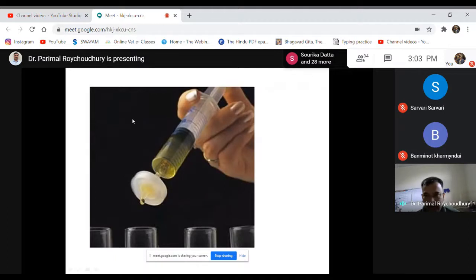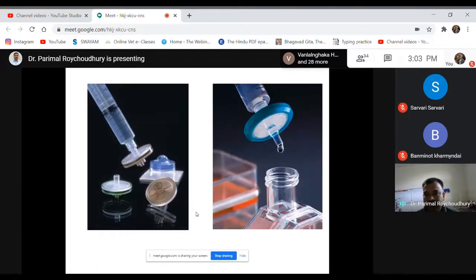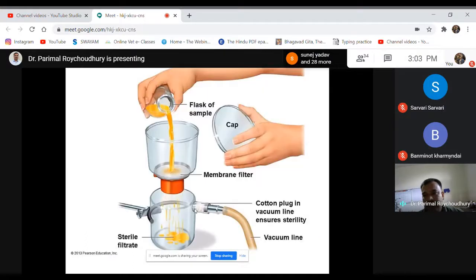These demonstrations will give you an idea. It's called the syringe filter because it is attached to a syringe and can be used for low volumes of media or chemicals. So these syringe filters are never used for higher volumes. Only a few mLs, like 5 ml, 6 ml, 1 ml, 2 ml of media or chemicals, we sterilize by syringe filter. If the amount is more, we go for the membrane filter assembly.